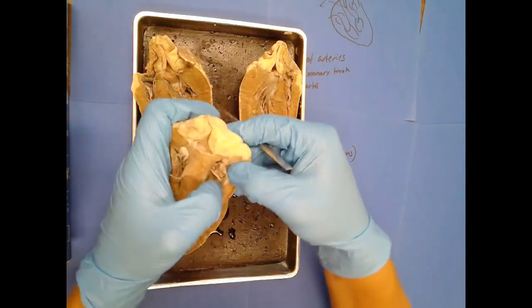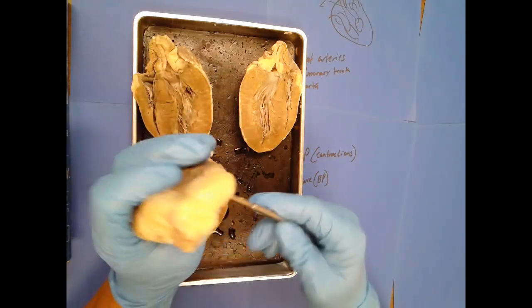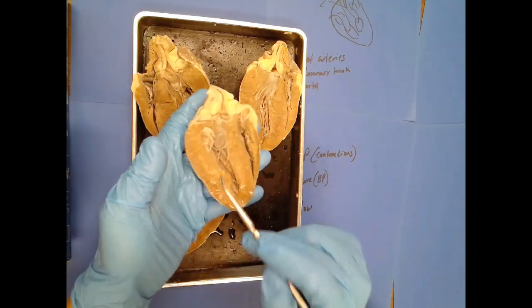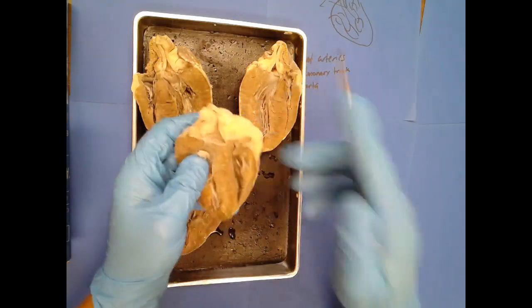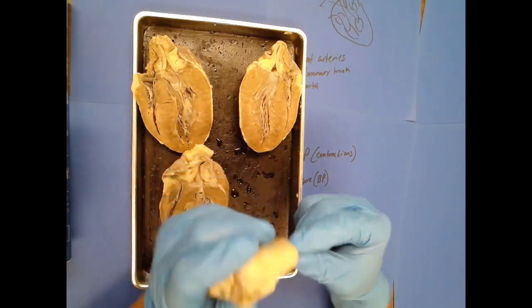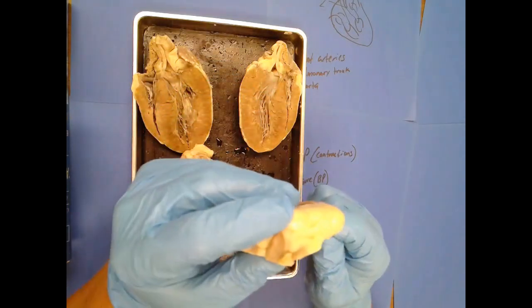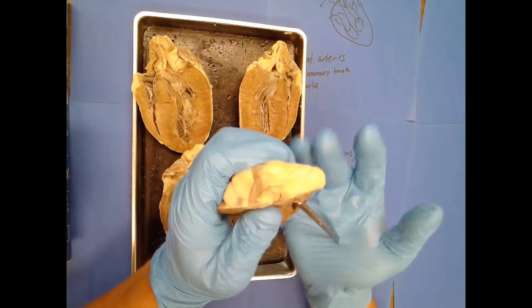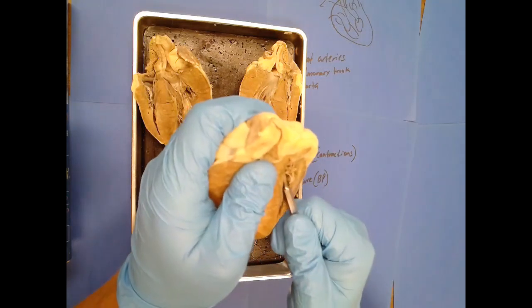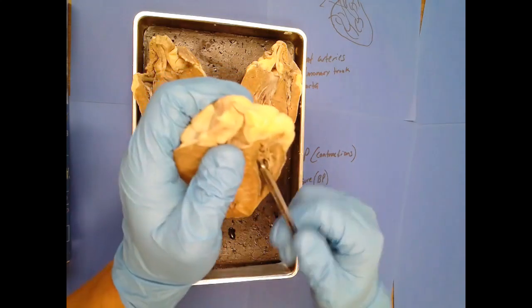Now also, remember how I said that the pulmonary trunk is more on the anterior side? If you see how I'm poking up against that right there, it might be hard to tell, but that's the pulmonary trunk. Remember, the right ventricle ejects blood into the pulmonary trunk, and the pulmonary trunk is anterior to the aorta itself. I'm actually touching the probe right there, so this had to go through the pulmonary valve to get into the pulmonary trunk. You can see me poking it right there. All right.